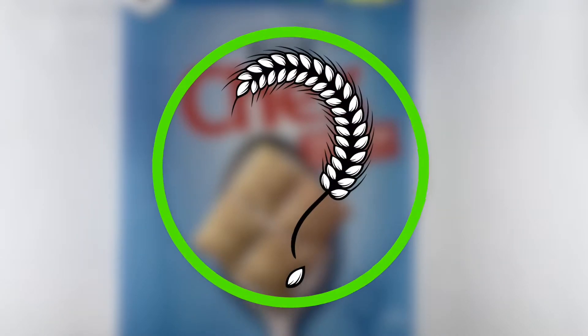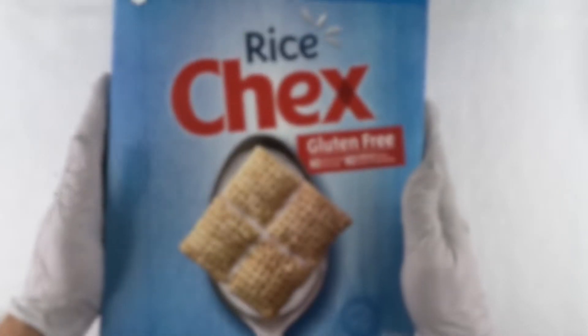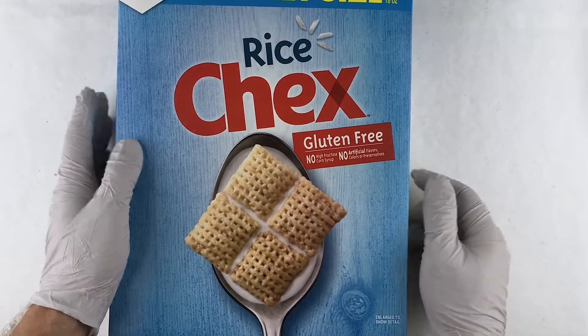Welcome to Is It Truly Gluten-Free? Today I am going to be testing General Mills Rice Chex. As you can see, this product is labeled gluten-free.